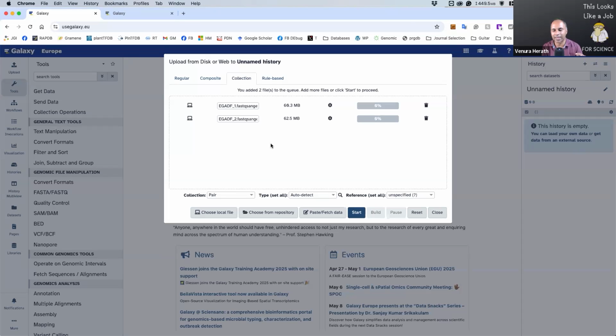Yeah. So shall we go fresh? That way it's easy. So upload the two files like what I'm doing here. I will show you there's a workaround, but otherwise some might get confused with the whole process.